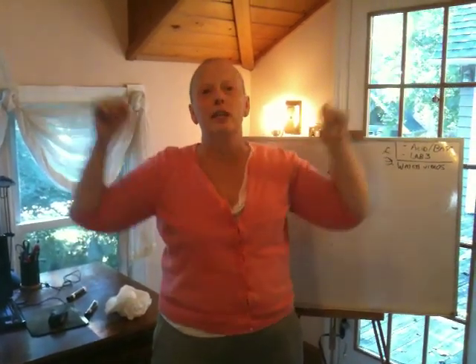So stretching, this is what's called symmetrical stretching. Okay, this is my CH2 group. It's been going a little slow right now. I better speed up. But it's constant, right? Then there's anti-symmetric stretching, which is like this. Okay, that has a different frequency. That occurs in a different position in the spectrum.